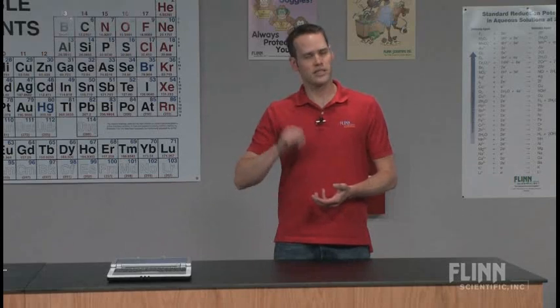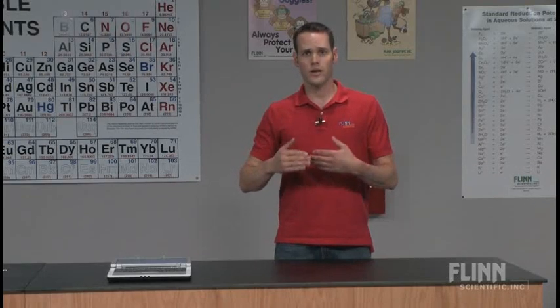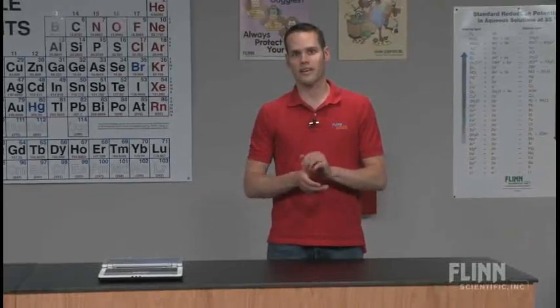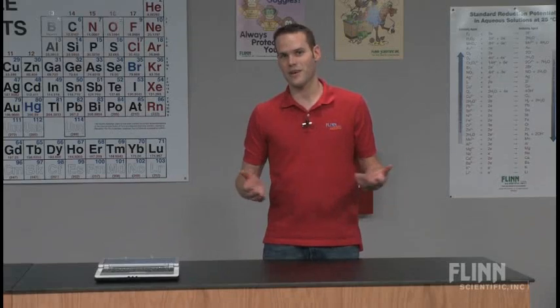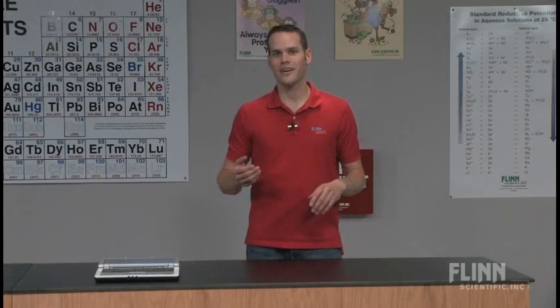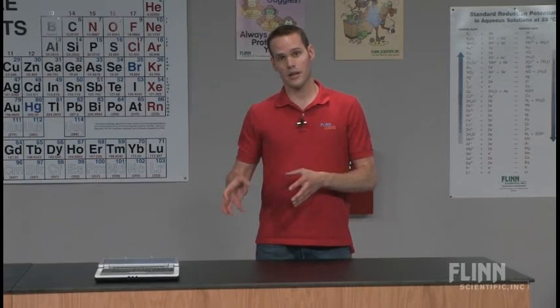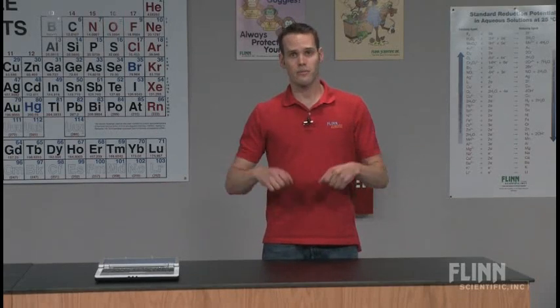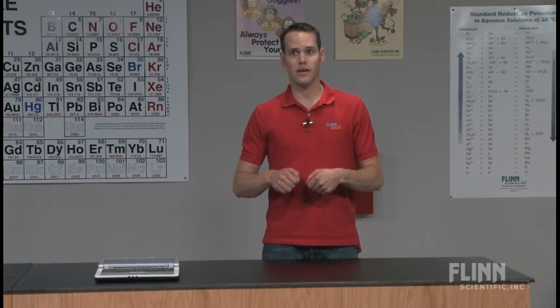Even if it's yellow, you can still shake it and it will turn blue, but the longer it sits, the worse it becomes. I did learn this the hard way because I set this up the night before in my first year that I ever did this demonstration, and came back the next day and every bottle was blue, and I freaked out and had to start all over again, and I only had 5 minutes of my time between classes to set that up. So I would certainly recommend mixing up the potassium hydroxide solution and the dextrose solution separately, then mix them together at the last minute when you need them.